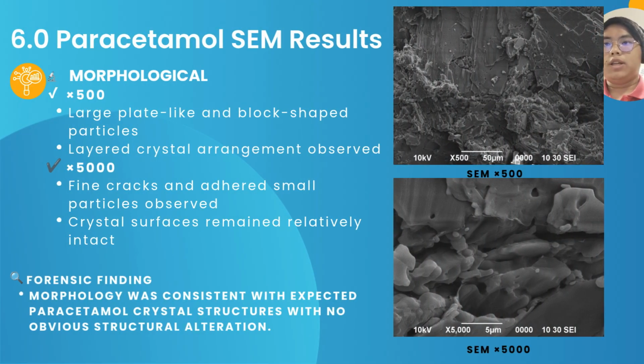The SEM image of paracetamol showed plate-like particles with layered crystal arrangement. At higher magnification, fine cracks and small adhered particles become visible. However, the crystal surface remained relatively intact. The absence of abnormal structural features suggests that the sample maintained its expected morphology without obvious physical changes.